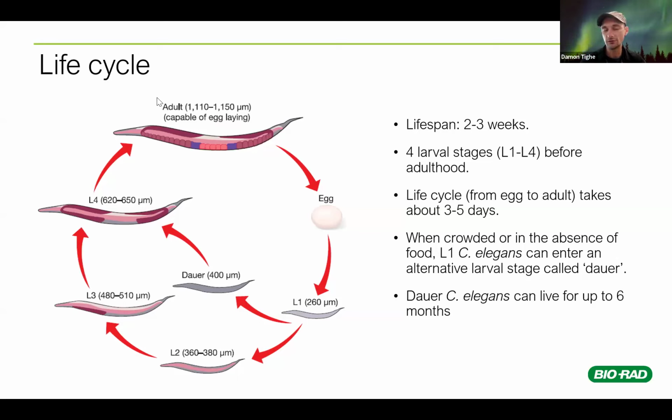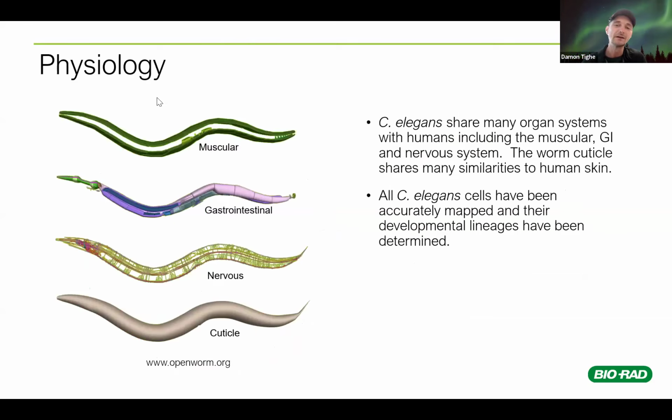The amazing thing too is that those eggs are really hardy, from what I've noticed. I've microwaved my worms before in order to pause them so they're easier to count. I thought that would kill them, and I left the plate out for a while. Then I realized I had worms in a couple of days. So I did it again and watched, and what I realized was that with the hermaphrodites that had eggs in them, the microwaving didn't kill the eggs, and the eggs could hatch days later. And so I've seen this too with other applications of heat.